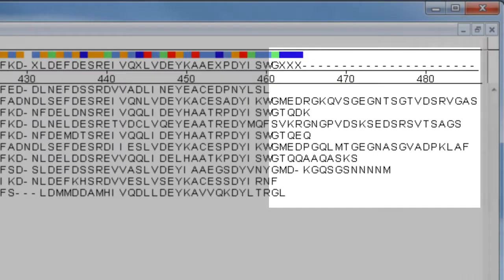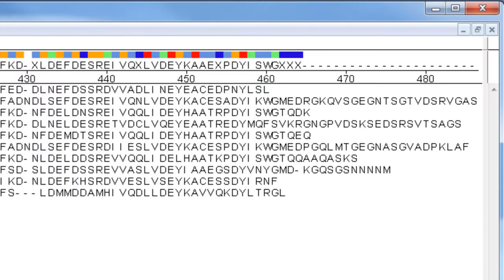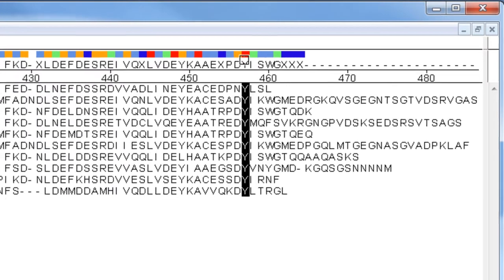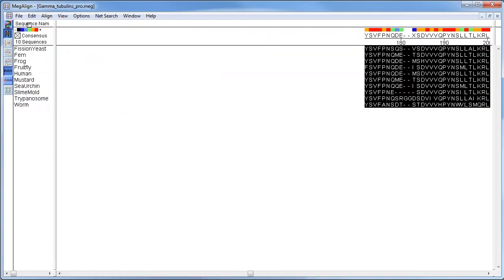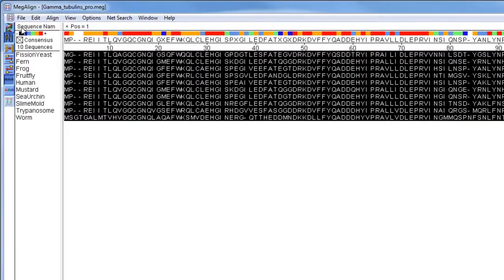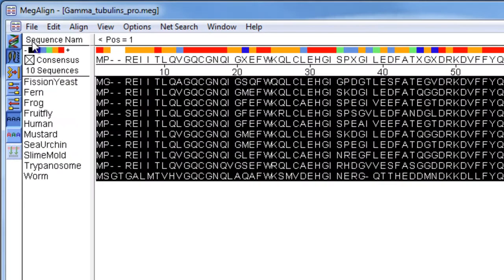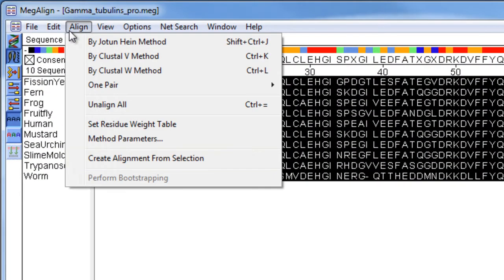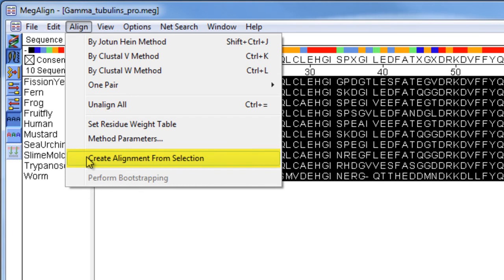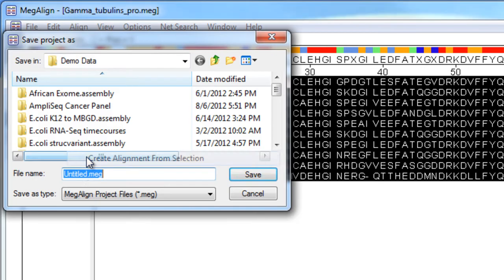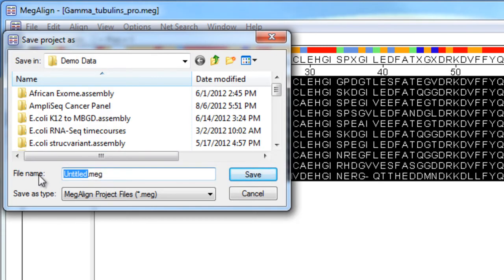I can exclude this variable region from the alignment by dragging my cursor over the region of the consensus that I want to include, and then selecting Align, Create Alignment from Selection. I'm prompted to save my new alignment as a new Megalign file.